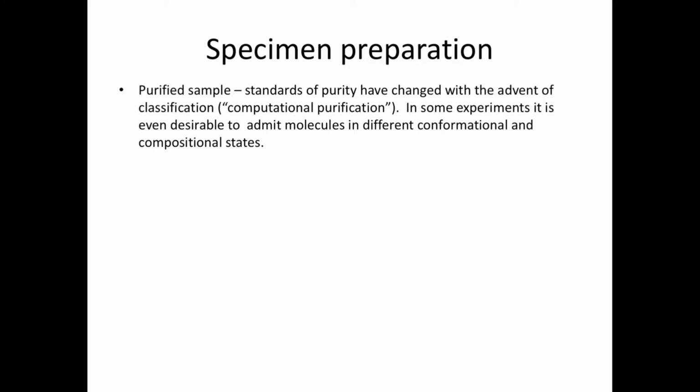We actually see a great advantage in being able to see the molecule in all its different forms in binding states. Previously, without the classification, we aimed to get one particular structure with one particular ligand binding state, for obvious reasons.